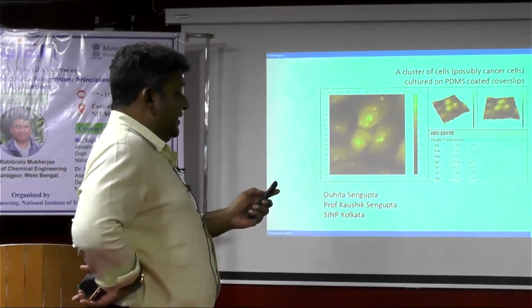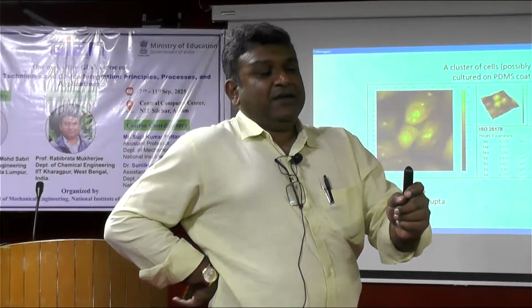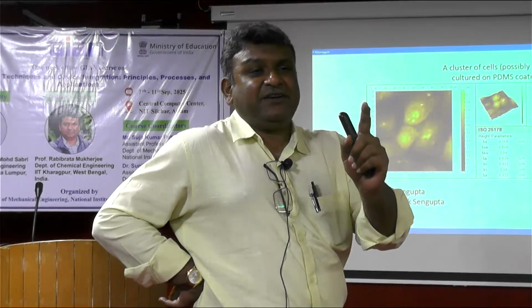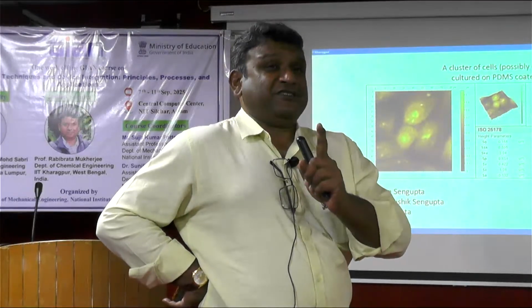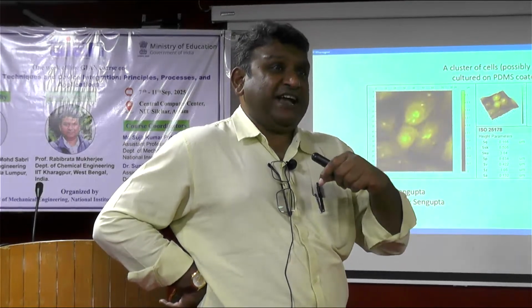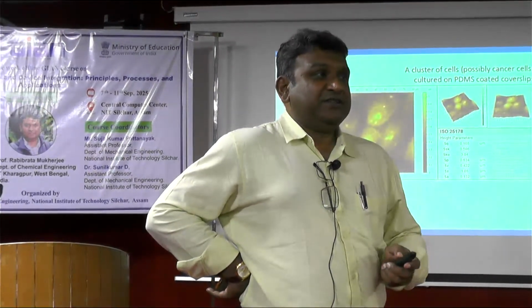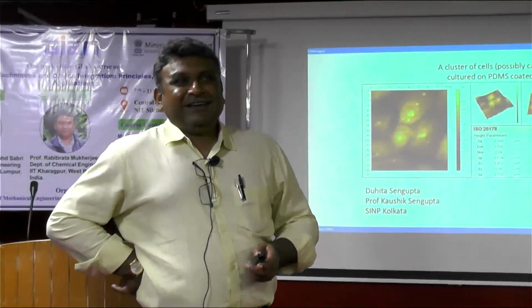We have an operator. So basically, to get to your question, your question is very well taken. You need to have a clear idea. Remember, as the students were listening, I told what force you are going to choose is your prerogative. That is the crux. Depending on the nature of the sample, with how much force you want to scan, you can basically destroy your sample or kill your sample or rupture your sample or whatever. That is something which comes with experience. So thank you very much.